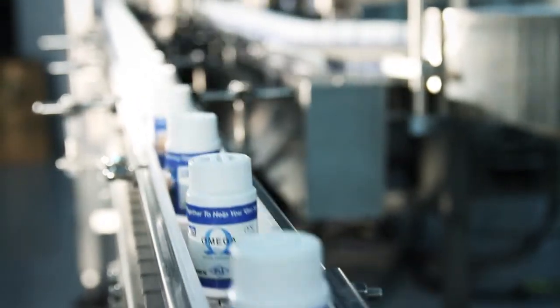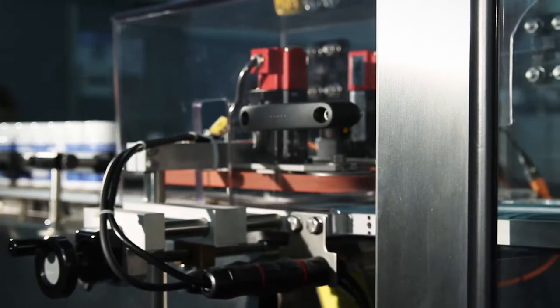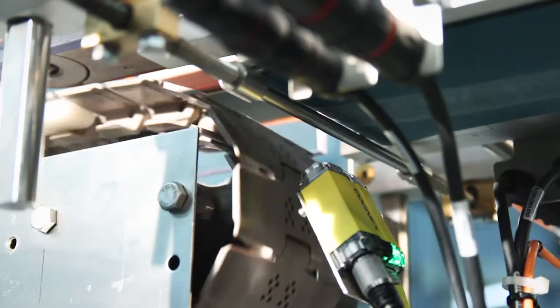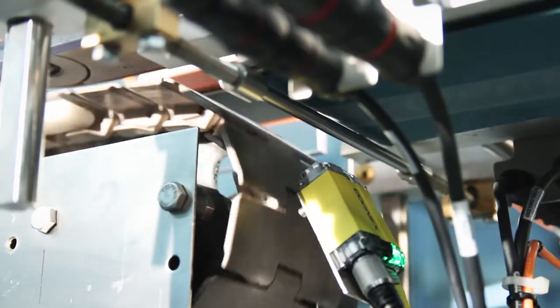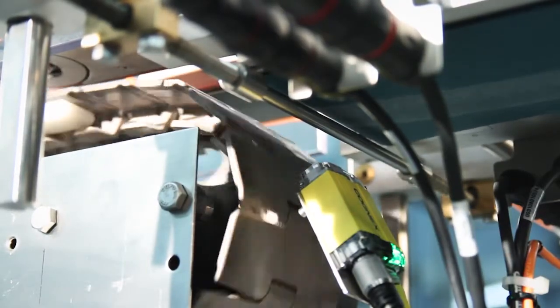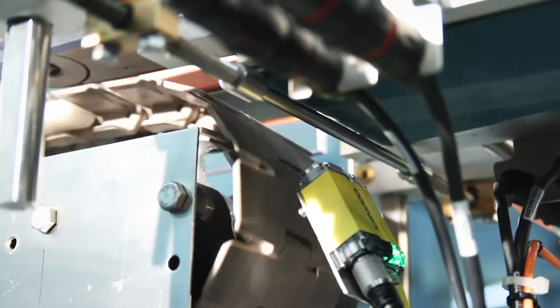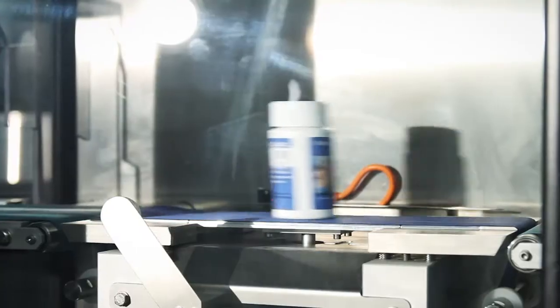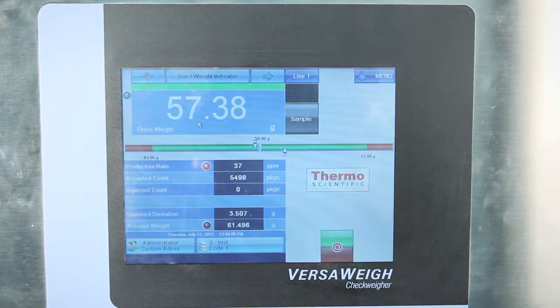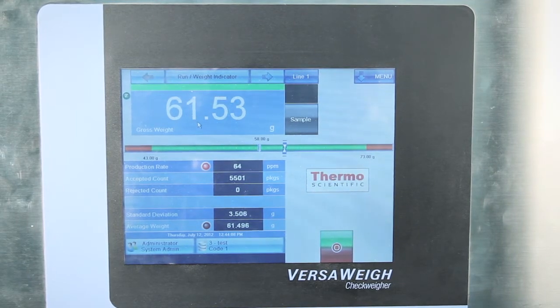When the product comes to the VersaRx checkweigher, there's a camera identifying the code on the bottom of the bottle. That code is unique for each bottle that's presented to the camera. We are then mating the weight information to that unique code so that any time in the future the customer can go back and verify whatever product went across that checkweigher and what the weight was.